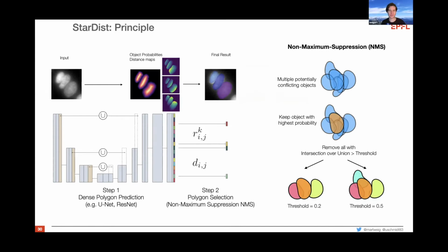So exactly. You don't, because you typically annotate with a label mask, and then it's not really possible to represent overlapping objects as a single image. So you don't typically do that. In principle, you could do it with StarDist, because StarDist can predict polygons that are overlapping. But the initial representation of your labeling, your annotations, is typically done non-overlapping, right? And it will figure out that actually two things should maybe overlap a bit, but that's not something that you need to do. No, it's hard to annotate.